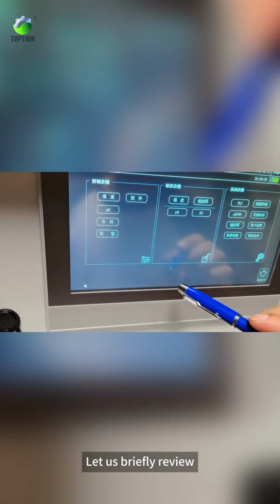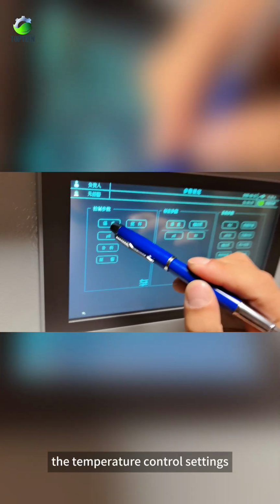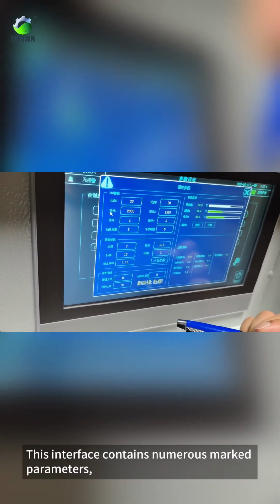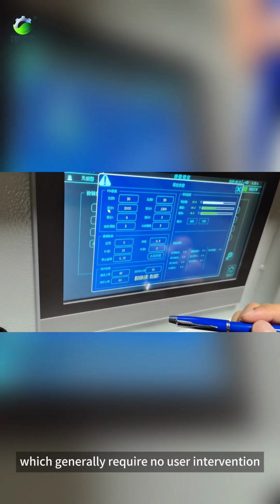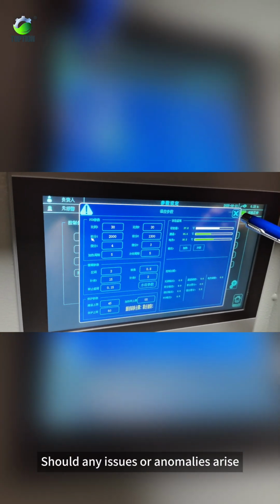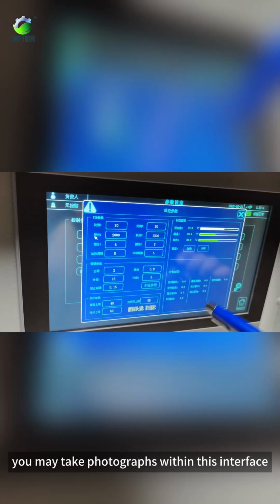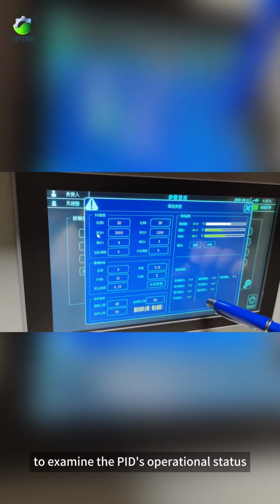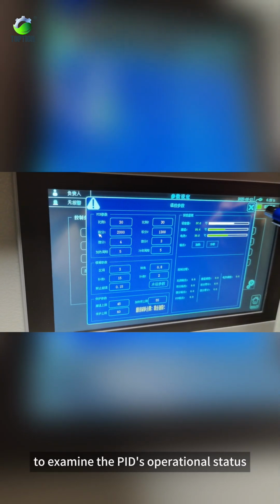Let us briefly review the temperature control settings. This interface contains numerous marked parameters, which generally require no user intervention. Otherwise, the temperature cannot be controlled. Should any issues or anomalies arise, you may take photographs within this interface to examine the PID's operational status.